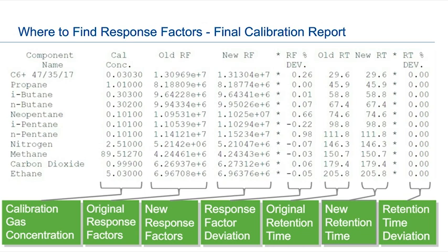The RGCs basically have four standard ones that you can pick from, lining up with your tariff requirements. There's also a custom one where you can put in your own requirements. You can make it 100% C6, you can make it 0% C6, 100% C8. That is what you select yourself as the breakout that you think is your C6 plus, so how much C6, C7, and C8 you have.